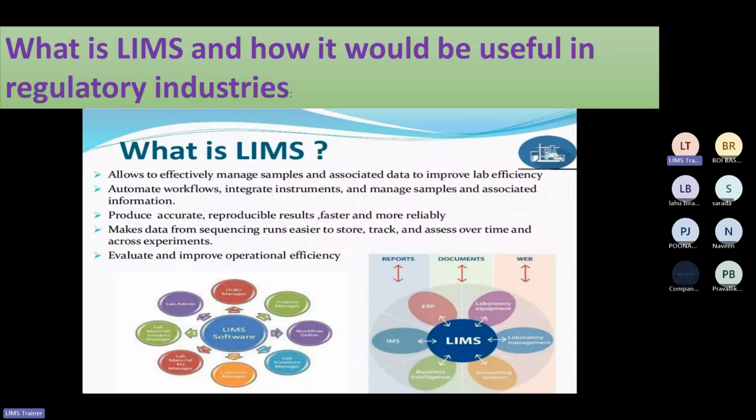We are doing some analysis, performing some tests with the sample, and generating data, right? This data that is generated is required to be preserved. It is required to be shared from one lab to another lab, or from one person to another person, like the manager or the reviewer, right? So this is how the data is required to be handled. To make it easy, this particular software is utilized.